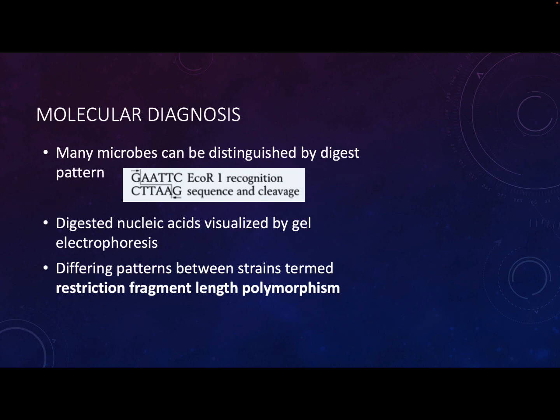If you're interested in doing more of a quick and dirty approach, where you're not necessarily trying to be super clean about it because you don't want to spend a lot of time, you can also do restriction enzyme digests.